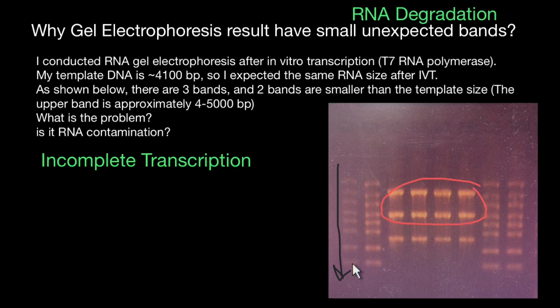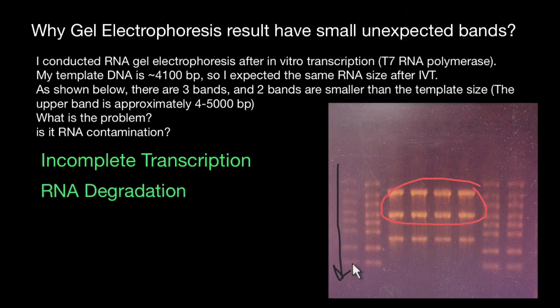Reason number two for such artifacts would be RNA degradation. RNA is susceptible to degradation by RNases, which can be present in the environment or introduced during sample handling. It is essential to use RNase-free techniques, equipment, and reagents throughout the experiment. Ensure that all solutions and buffers are RNase-free.